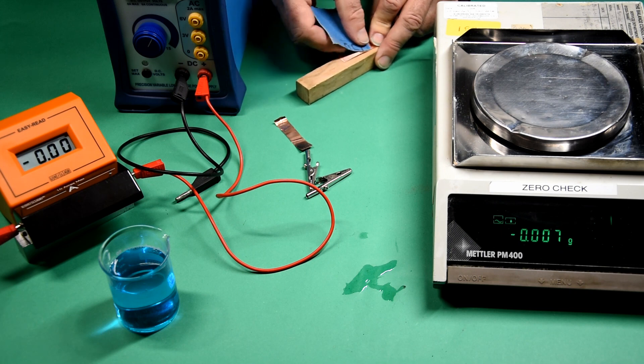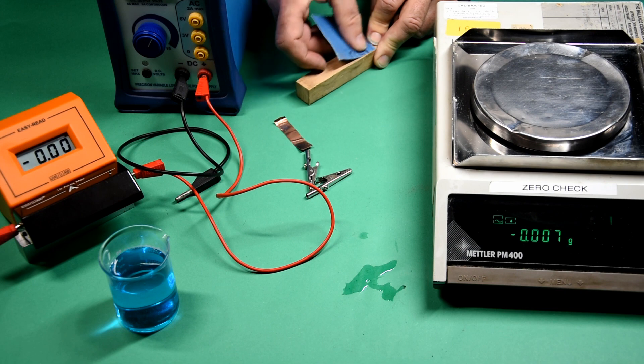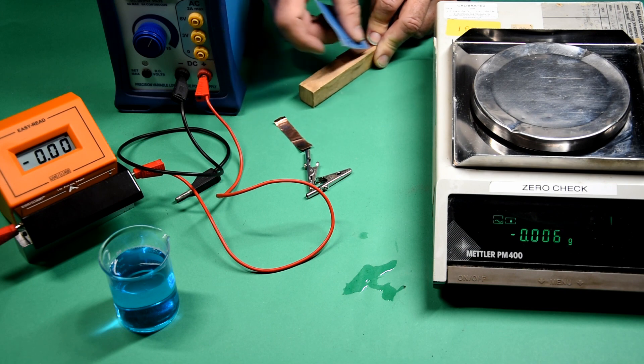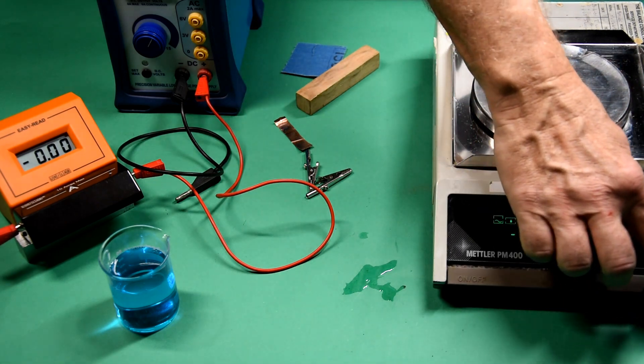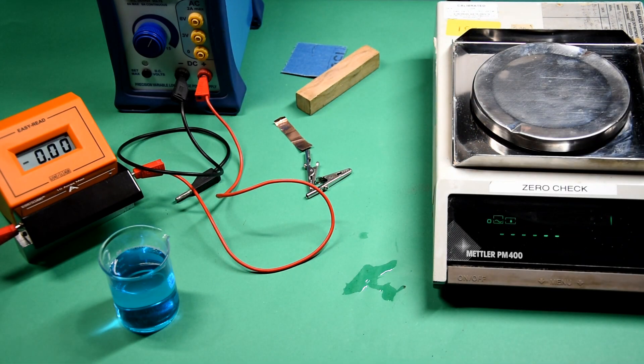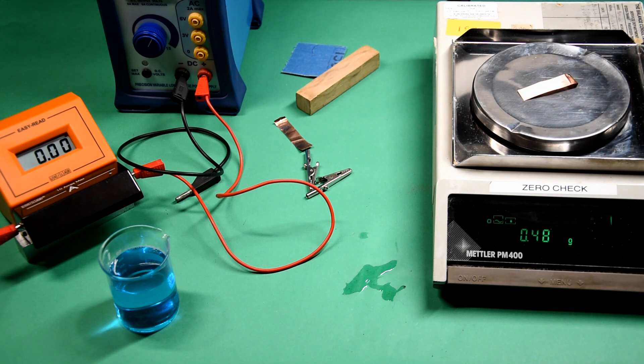The electrodes are cleaned with emery paper - this is to get rid of the copper oxide, which might otherwise prevent a current flowing. The balance is zeroed and the electrodes are weighed. In this case, we're starting with the anode.